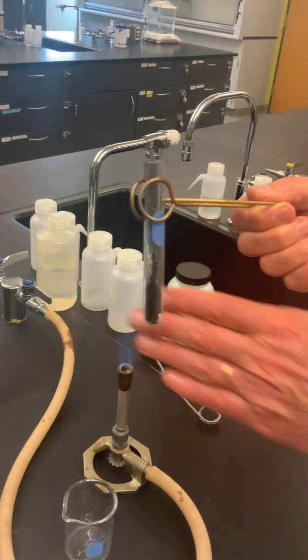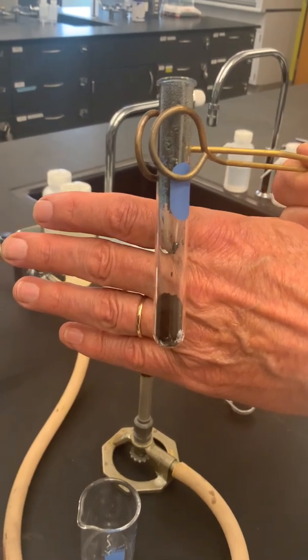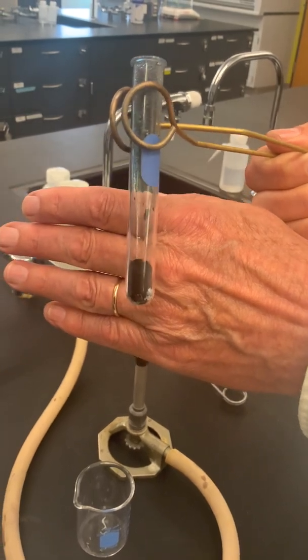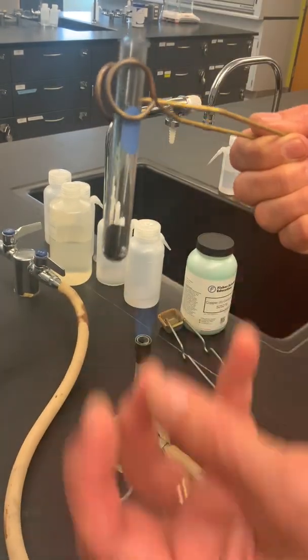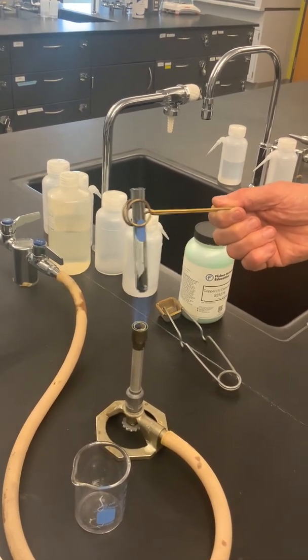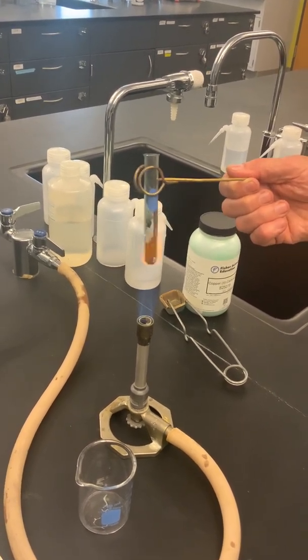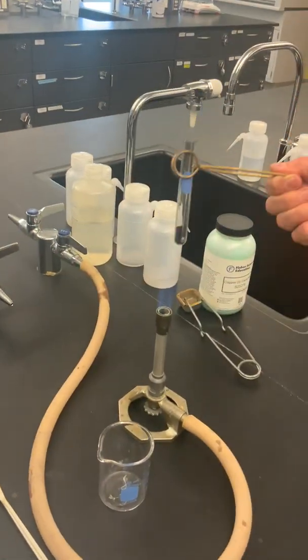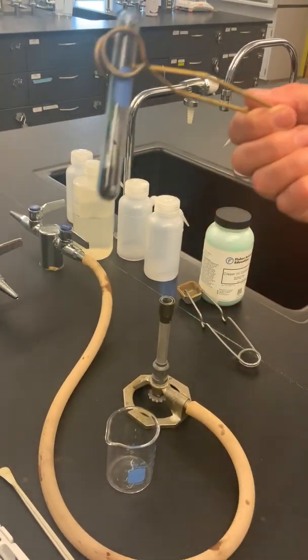If you look carefully there, I don't know whether you can see it, but you can actually watch the solid particles jumping up and down, which is a very interesting phenomenon and suggests strongly that in this decomposition reaction, some gas is being produced, and it is the evolution of that gas that is causing those particles to jump up and down. The other, of course, obvious indicator of a chemical reaction is that dramatic color change. Again, you can watch those particles jumping up and down in there from the pale green to obviously a black solid.